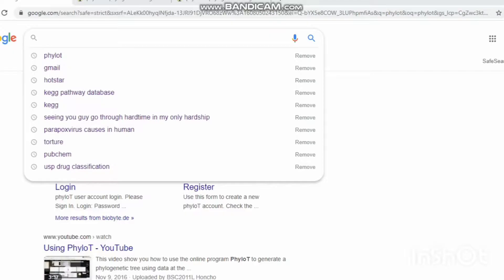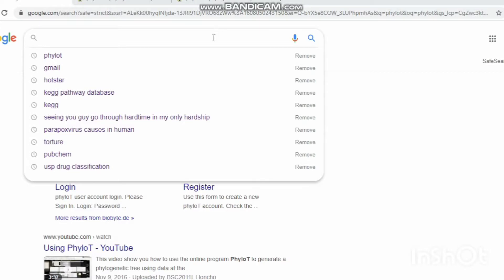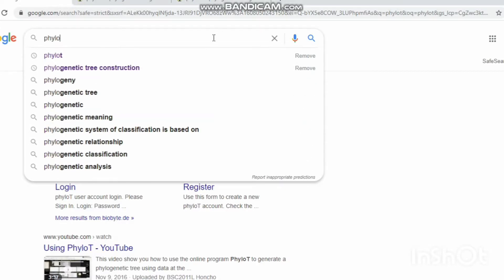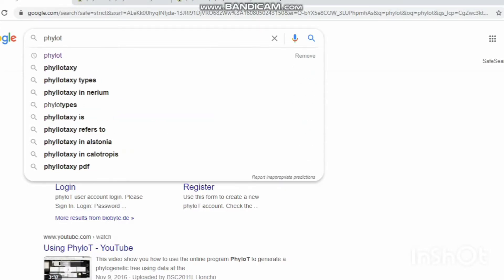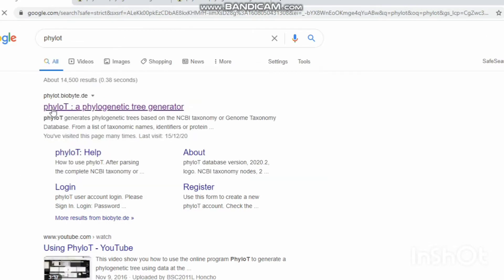Give the phyloT keyword in your Google search, then click the phyloT phylogenetic tree generator.